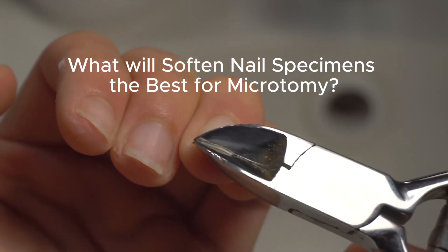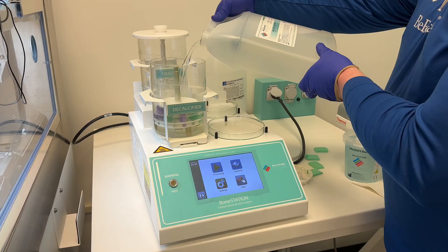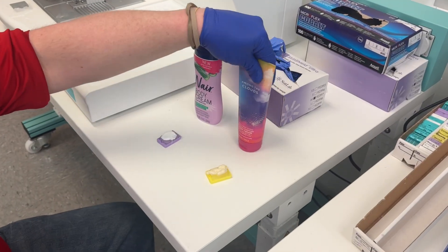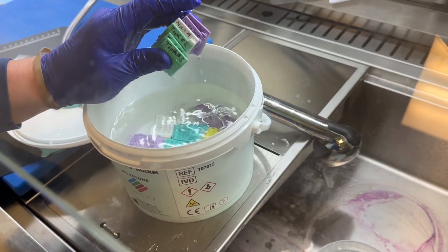Today we're testing a few different methods for softening nail specimens to see which gives us the best results during microtomy. We're comparing EDTA decalcification, lotion, Nair, and a control nail with no extra treatment.